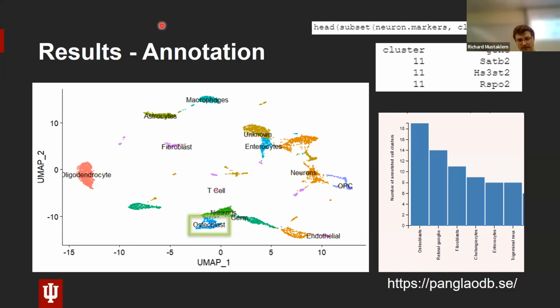You look at this graph after you annotate and you say, okay, neurons are highly correlated with oligodendrocyte precursor cells. And enterocytes, well, they're connected to this unknown group that's not even in the database. That's what this group is. Unknown means it wasn't in the database when we annotated. But I wonder what this group is about up here, right? Because it looks like they're highly correlated to enterocytes, yet we don't even know what they are.